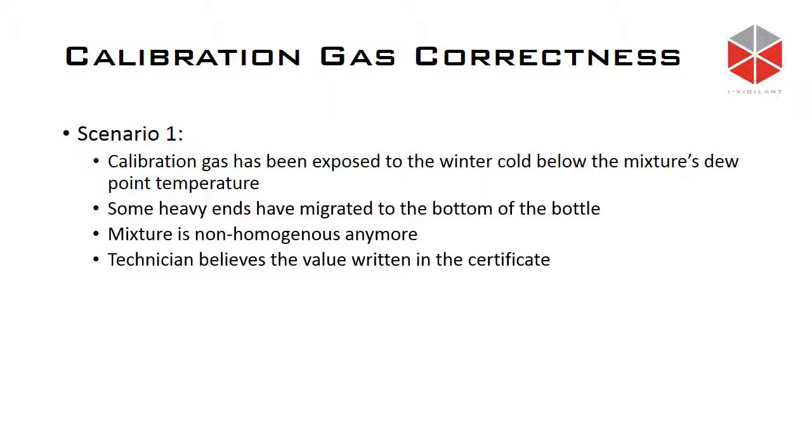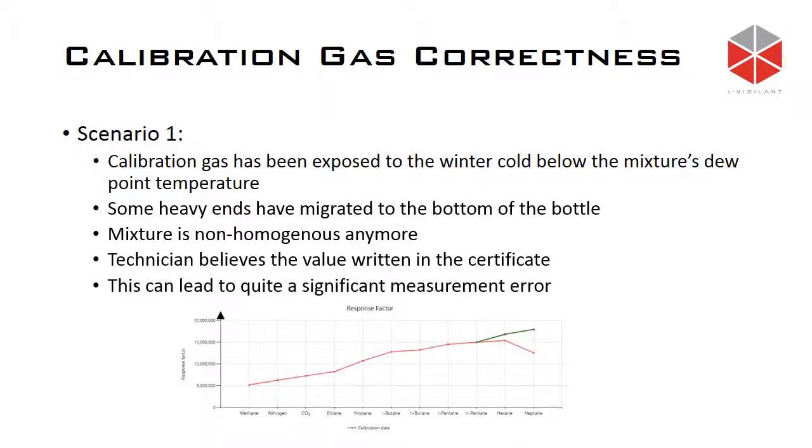A lot of times, the technician will just believe what the certificate says. The certificate will be right because it should be. But if we actually have the bottle sitting in the winter cold, then the certificate will not represent what we actually have inside the bottle anymore. And a lot of times, this is what can happen.